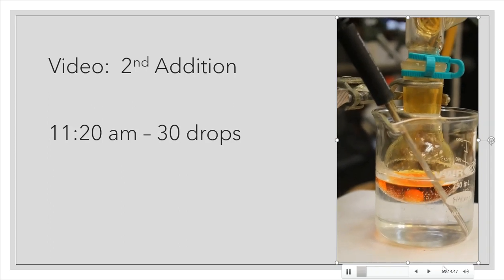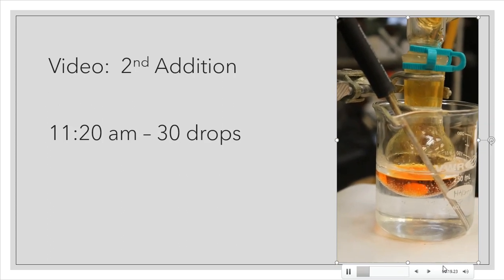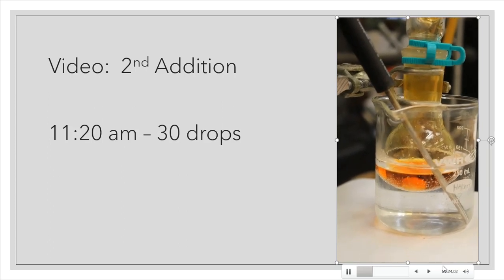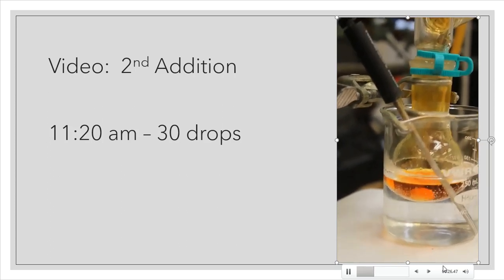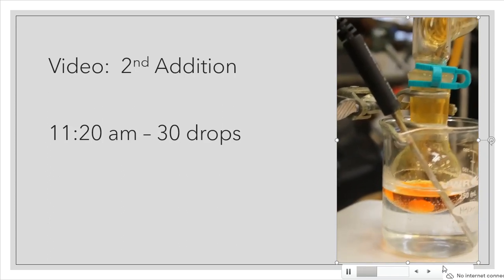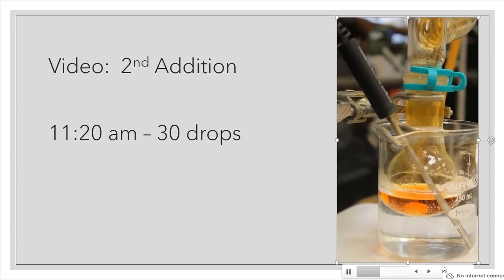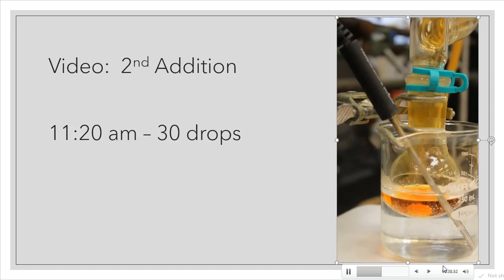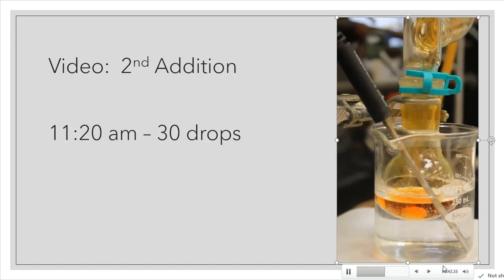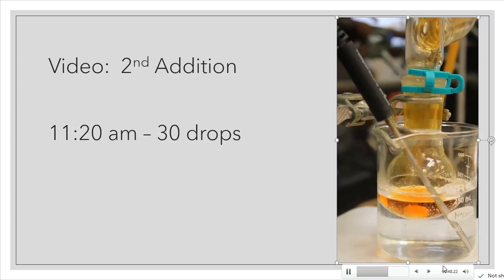In the lab directions, it tells you to wait until that dark orange color goes to at least a light orange color. And as I'm recording this video, you actually might see it get lighter and lighter as it begins to react. The reason this color is disappearing is because the bromine is adding on to that double bond. It's breaking the double bond, and that bromine is slowly getting destroyed. And only Br2 is that orangey color. So once the Br2 molecule has been chopped in half and added onto the alkene, that color is starting to disappear.